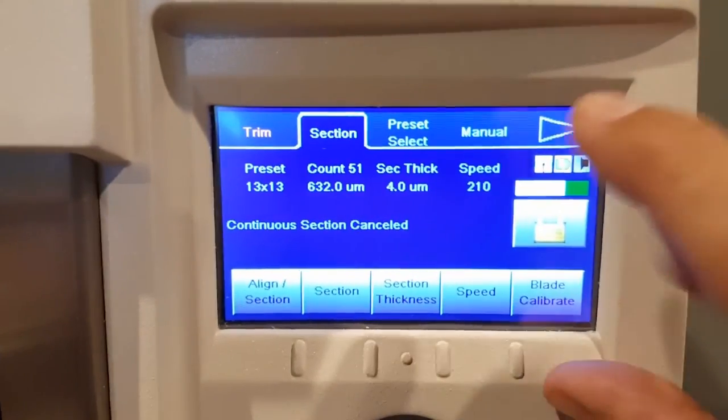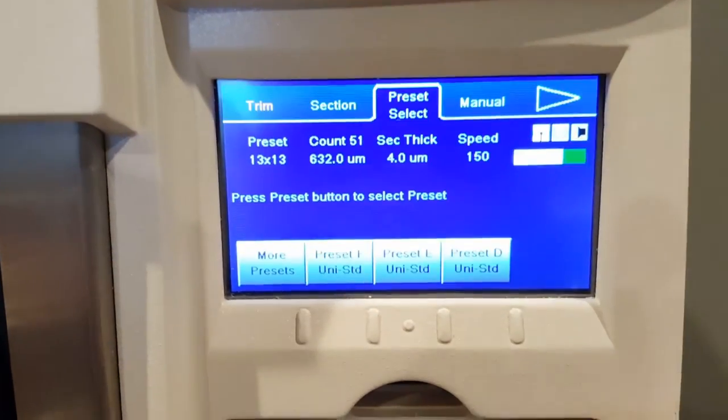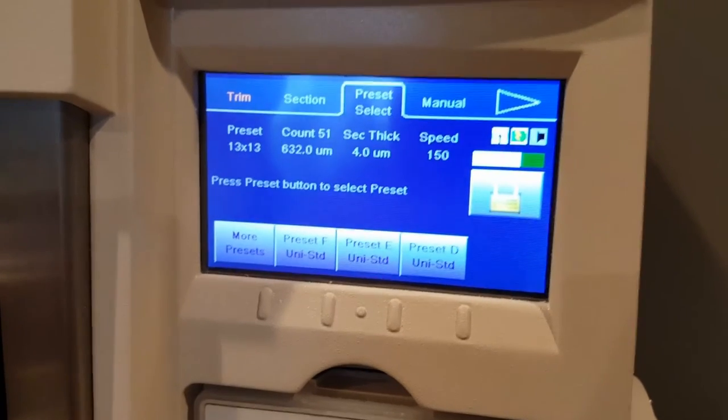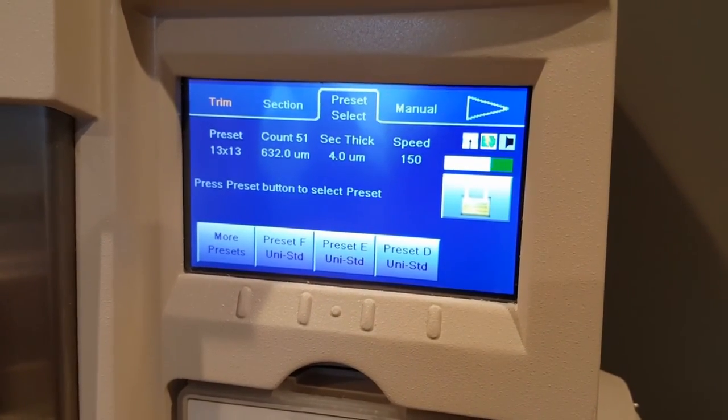You can actually, on the preset, create a program for what type of block you're cutting. I don't know too much about that, so I'm going to figure that out and maybe do another video after this one.